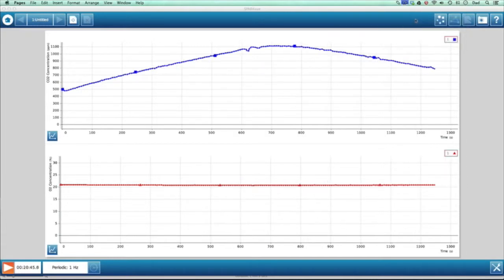Well, there you see, after about 20 minutes of runtime, right about here is that 10-minute mark. That's kind of the halfway point. And then right here, right when we first started, those are kind of landmarks for you to make a guess what happened in that time. I'm going to let it go another 3 minutes just because of this plateau.